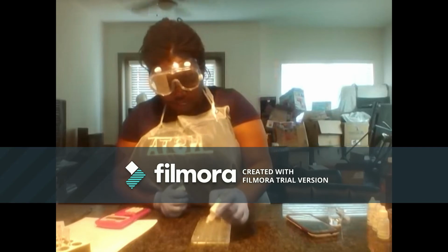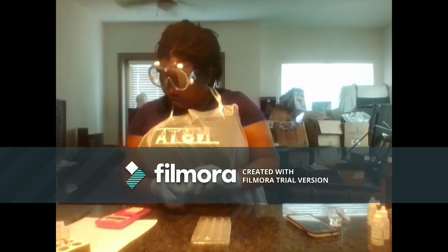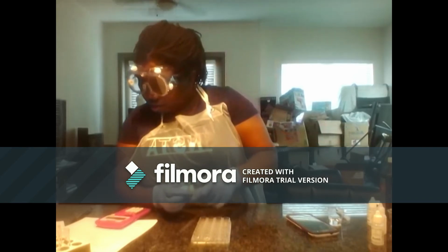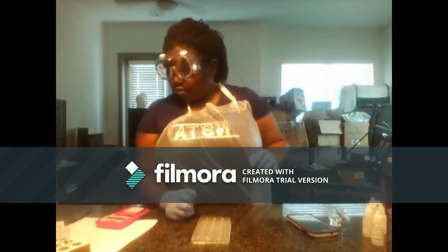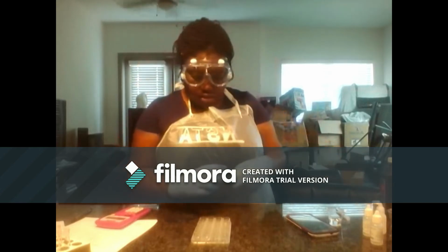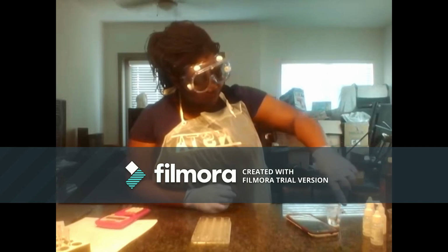Will be 4 drops of potassium iodide, 2 drops of hydrochloric acid, 4 drops of starch solution, 4 drops of water, eight drops of sodium thiosulfate, 1.4 mLs of hydrogen peroxide.